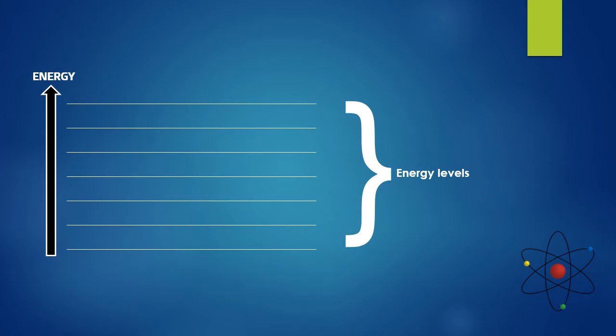Molecules or atoms can only possess particular amounts of energy, or specific energy levels, in which they are stable. So, when light of a particular energy interacts with an atom or a molecule, it absorbs that energy and goes into a higher energy level. If the energy matches that of any of its stable levels, it stays there. If the energy is in between these levels, then it returns back into its former level by releasing the energy.